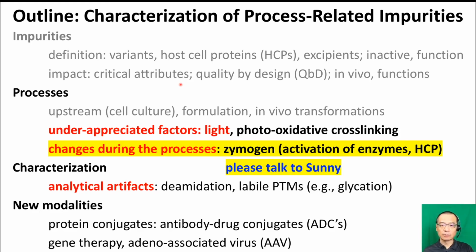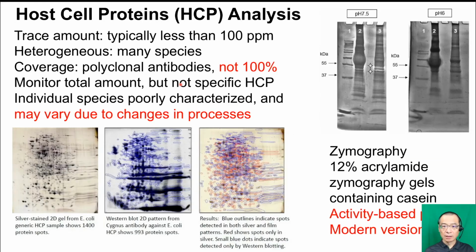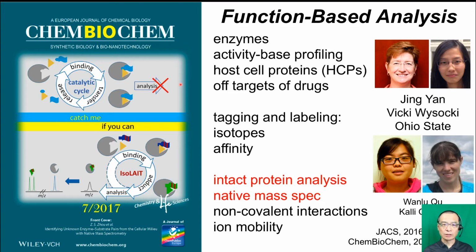It's an inactive form of an enzyme. This is particularly relevant to host cell proteins. Again, I will not go into much detail today. Feel free to talk to me about this ongoing program. Just to give you a very quick example: there are lots of host cell proteins, and the detection of host cell proteins is still challenging, as you know. Some are low abundance, but sometimes it is also because many of the analyses are based on mass spec ID or immunoassay, but not on activity assay. So one of the programs we are doing is using an activity-based probe to functionally analyze these proteins.